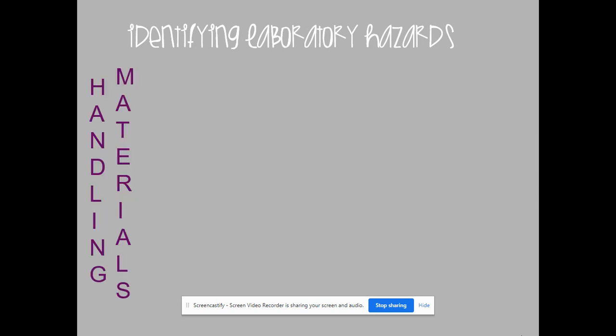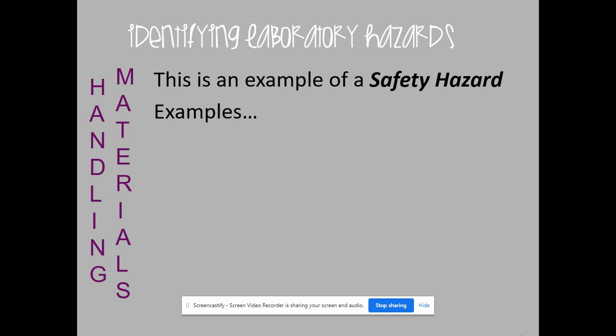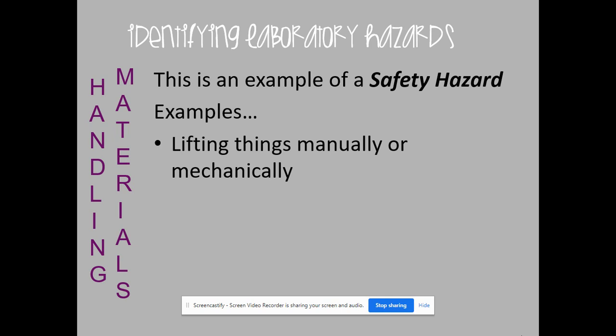Okay. The third one is called handling materials hazards. So what does that kind of include? Lifting things manually or mechanically.